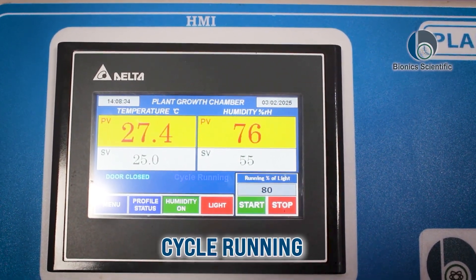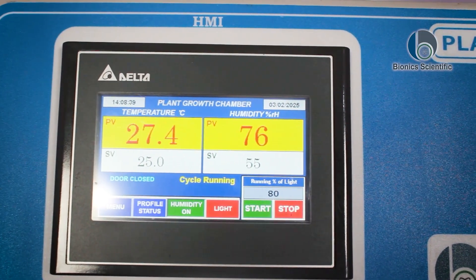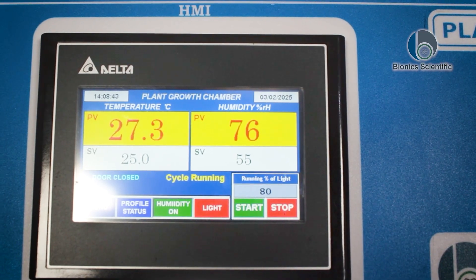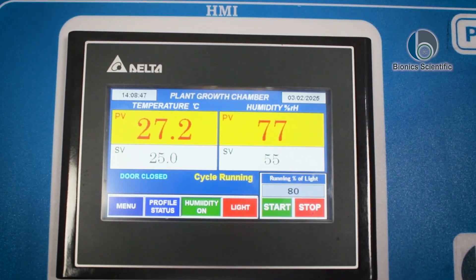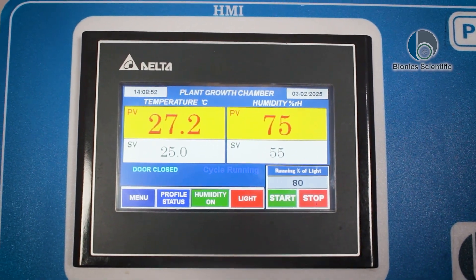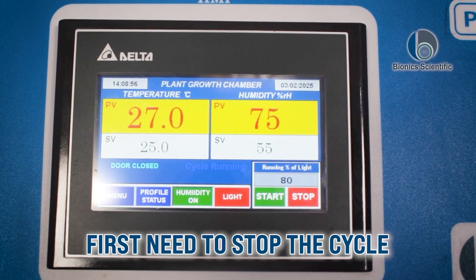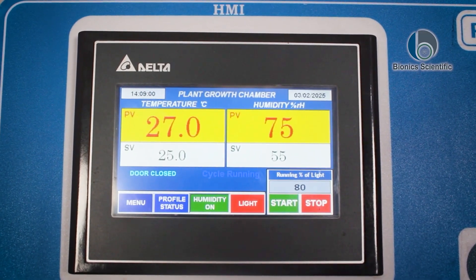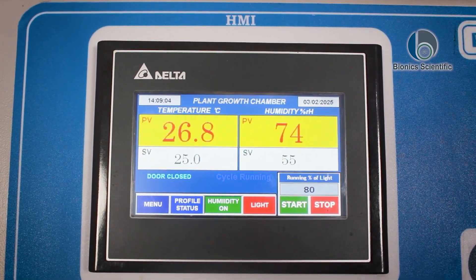You heard that sound again. Our present temperature is 25 degrees Celsius and our humidity is set to 55. The current humidity reading showing is 76, and that's how it works. Remember: whenever you are setting the temperature or humidity, you must first stop the cycle. The same procedure applies for both temperature and humidity settings.